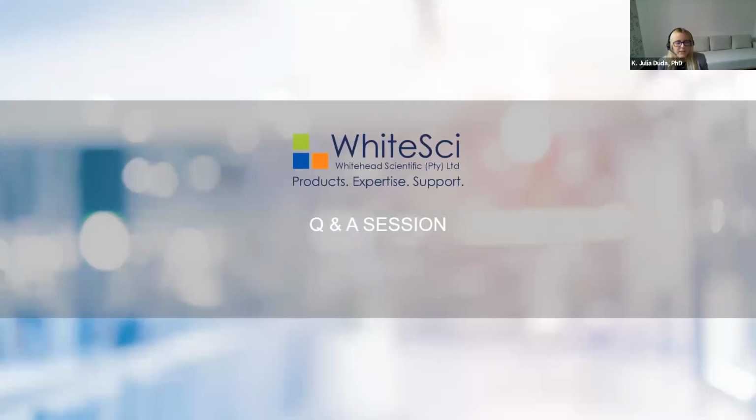Okay, so we have one question. The question is, please comment on automation options. So is the workflow automation compatible? Yes, the workflow is automation compatible, and we have in-house several scripts that were developed for various machines. There is various testing done on these scripts, either with reagents or just water. Some of them are more developed, some less developed. We can also provide support for automation if we do not have any script available.